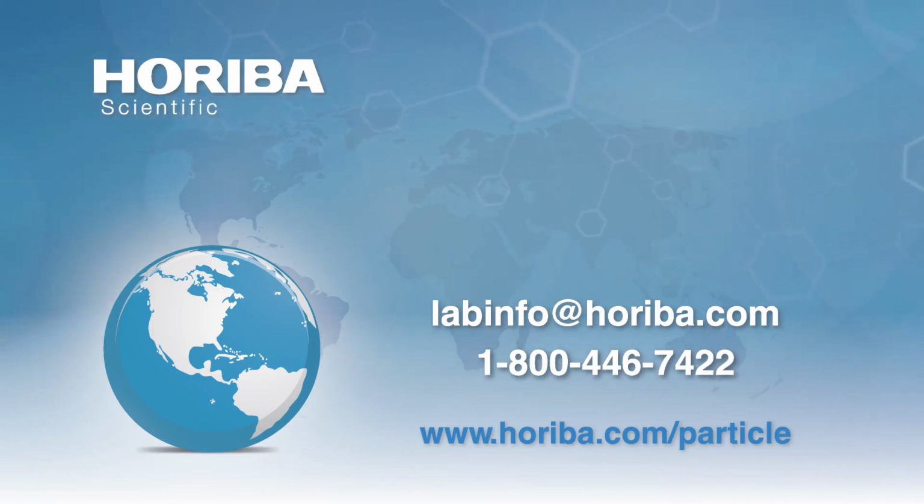So Mike, I have Jeff in the background and he would like to make a comment regarding this question. Go ahead, Jeff. Yeah, so I'm going to take a quick guess that he's asking about polydispersity index, which is the breadth of the size distribution. And so when you do a dynamic light scattering measurement, you'll often extract a z-average size and a width of the size distribution.